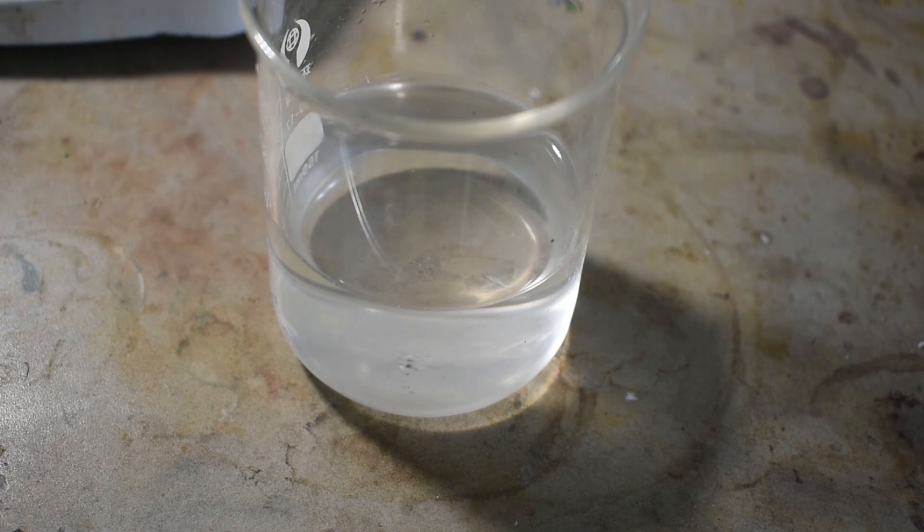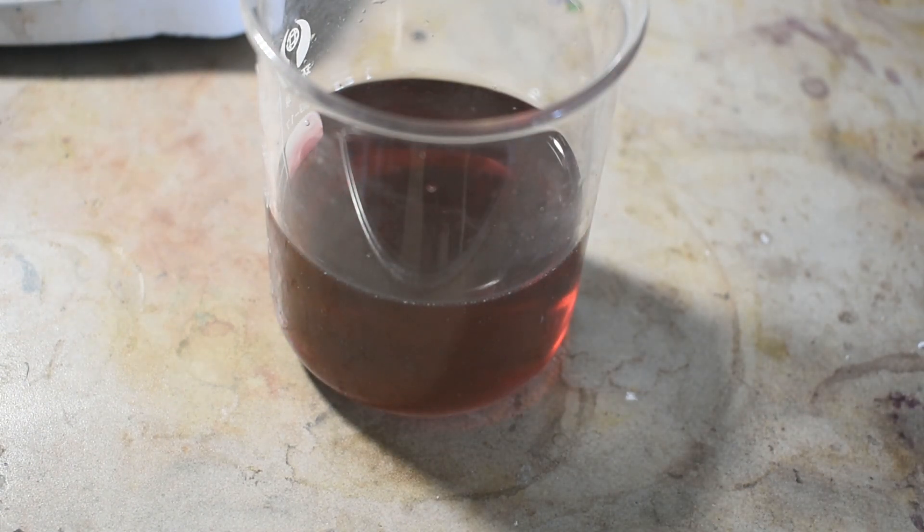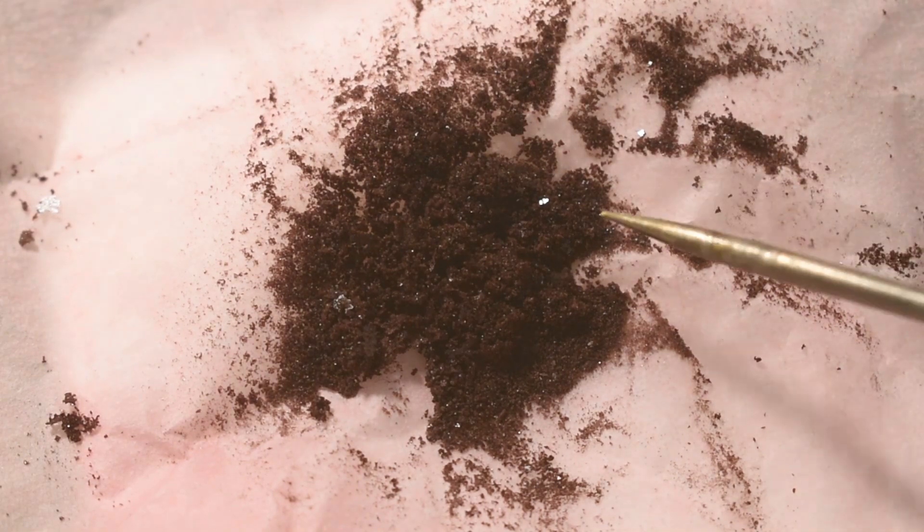The only form in which I could get this complex to be stable as a solid was the thiocyanate salt. By combining a solution of potassium thiocyanate with a solution of our complex, after a couple of hours, a nice red crystalline powder precipitated out.